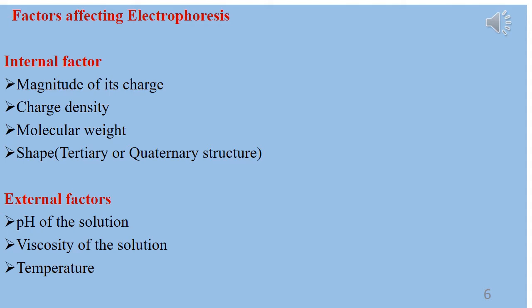Viscosity of the solution. As the viscosity of the medium increases, the rate of migration of charged ions decreases and vice versa. Temperature. Temperature affects mobility indirectly since viscosity of the supporting medium is temperature dependent.